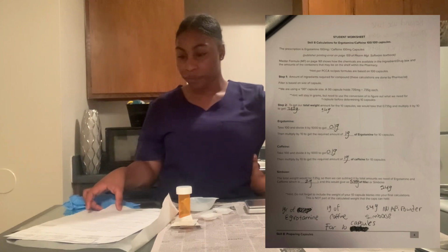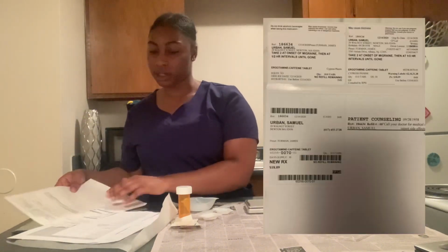So to recap all of that, 1 gram of ergotamine, 1 gram of caffeine, and 5.4 grams of the Symbase is what we need for Samuel Urban, which is our patient today that we are preparing the capsules for. Now that we have our calculations, we are going to gather the necessary materials.